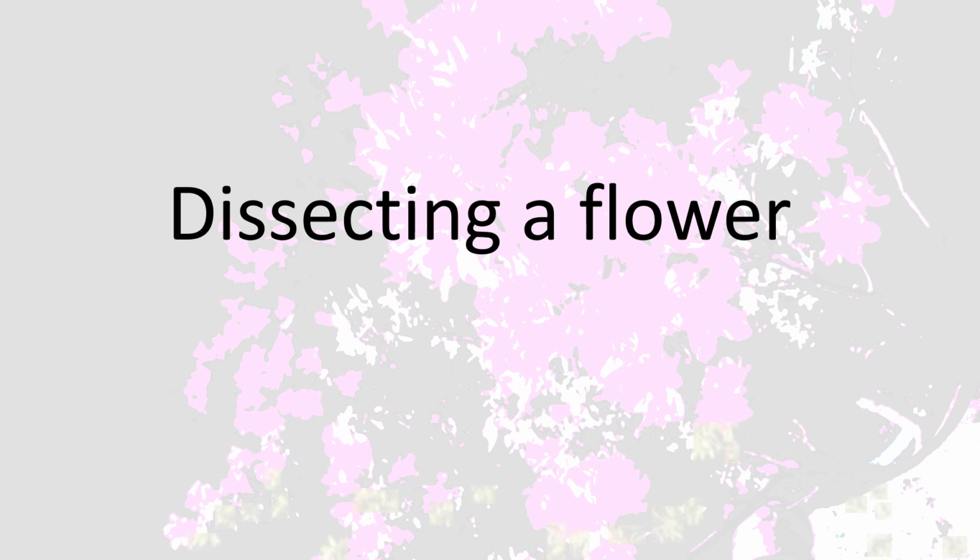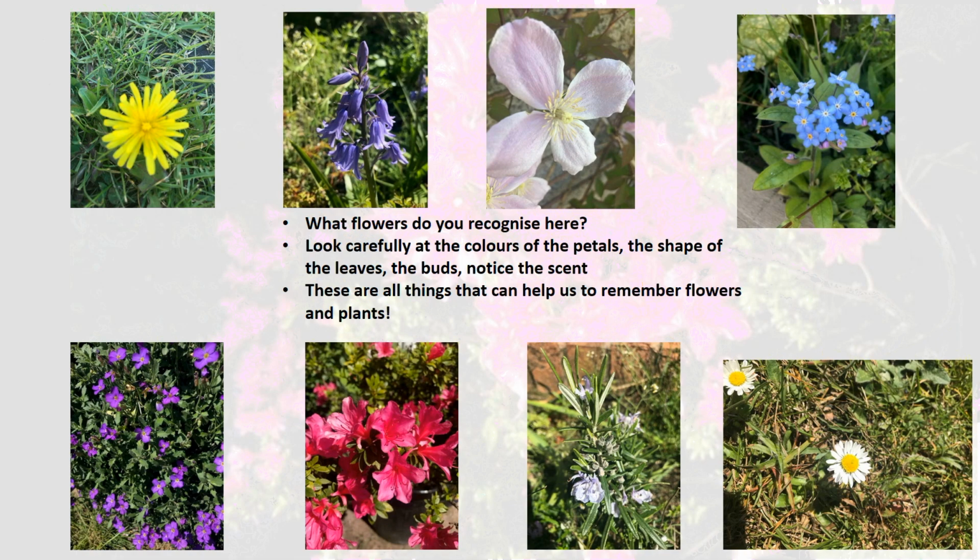Today we're looking at dissecting a flower. Okay, first of all, have a look at all the flowers I have popped on here. These are all from my garden. Do you recognise any of them?